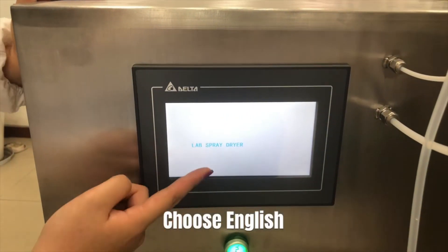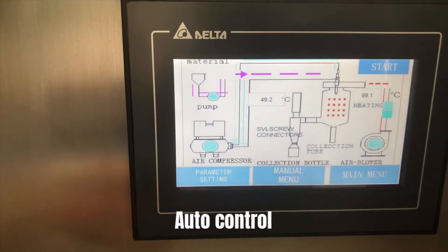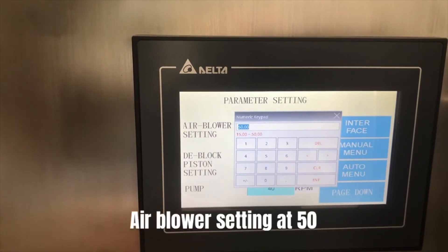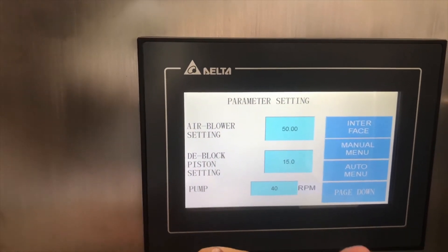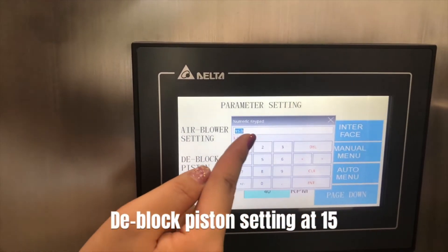Choose English, auto control, parameter setting. Set the air blower at 50. Set the de-block piston at 15.